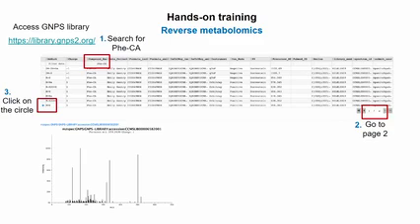In the article that we published, I think in box 2 or 3, there is also how you should interpret and how you should choose an appropriate MS/MS spectrum. So it's all in the article, how you should proceed to assess it. Did you guys retrieve all the 3 different tables for the 3 different molecules? Not yet? Okay, just wait.